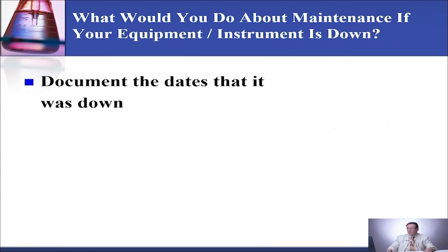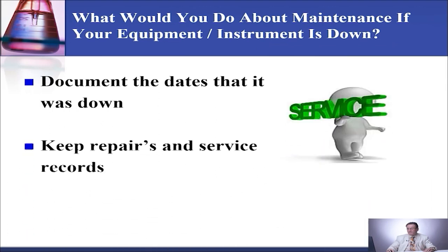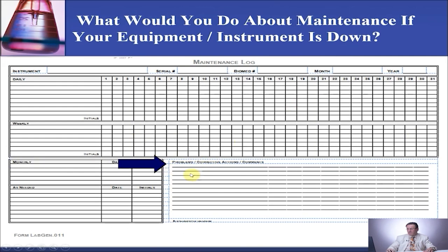What would you do about maintenance if your equipment or instrument is down? You document the date it was down. If it was for a week, then you say the instrument was down and the engineer came and fixed the machine back for operation on this date. You need to keep your repair and service records, and that's where you document your problems and issues — if the machine is down or if the maintenance was not done on the equipment or instrument. If your note is too long, you can write 'see attached' and attach a separate sheet of paper.